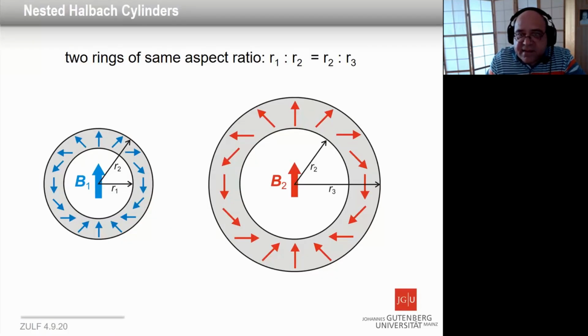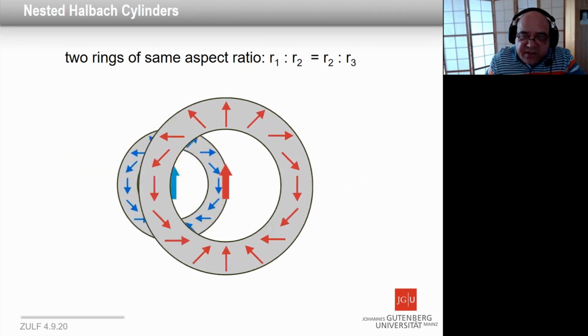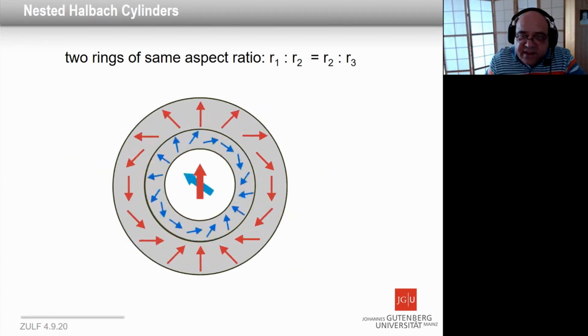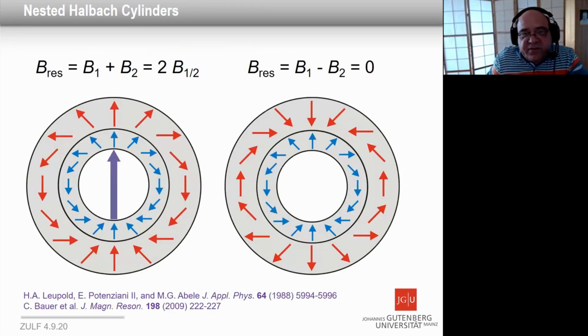Okay, this brings me to maybe the most interesting feature of these Halbachs, and this is, since they don't have a stray field, you can easily put them into each other, nest them, so to say, and rotate them without having too much of an interaction between the rings, because on the outside, this is not a magnet. At least that's true for dipoles. So that gives you the option to have two extremes. When they're both parallel, you have the full field of both rings adding up. And if they have geometrically produced the same flux, you can also completely cancel the flux.